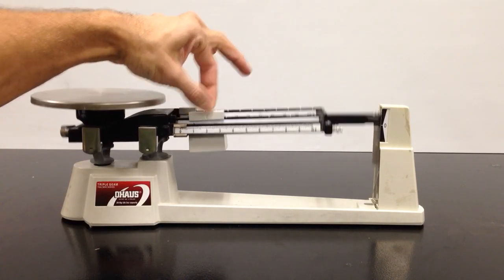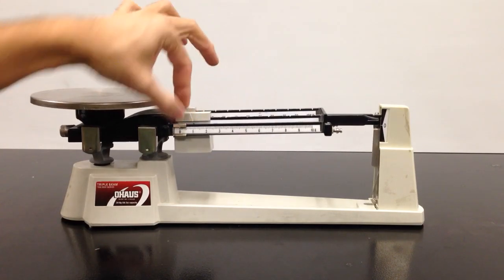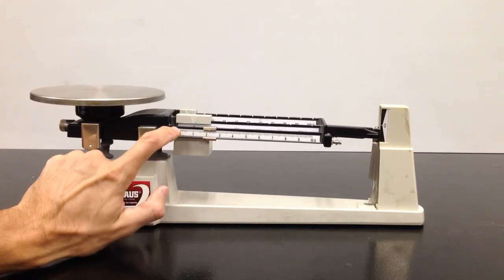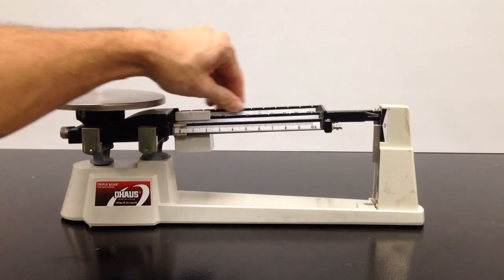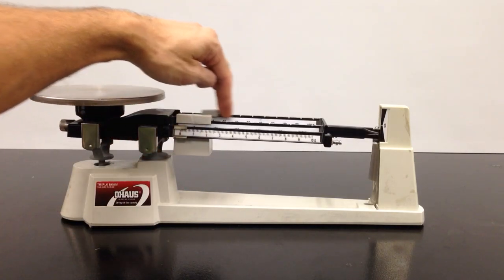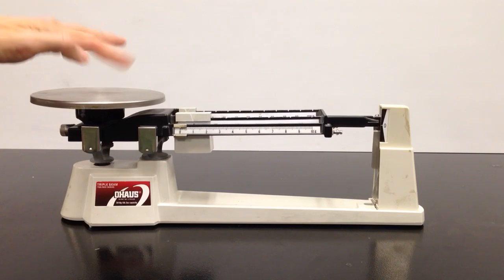This weight right here is for the hundred gram increments. This one's for one gram increments, or even tenths of a gram if you read these little lines here. And then this weight in the back is for ten gram increments. This is the tray where you'll put your specimen, whatever you're measuring.